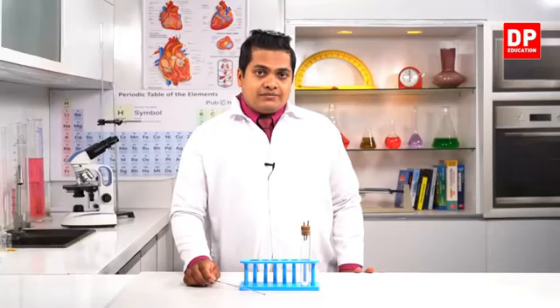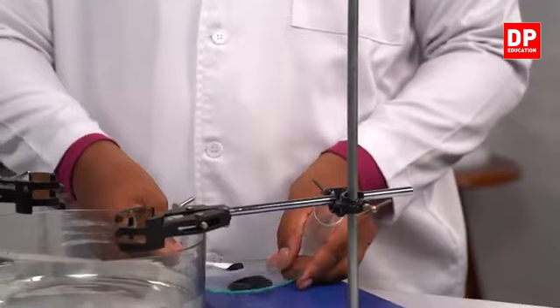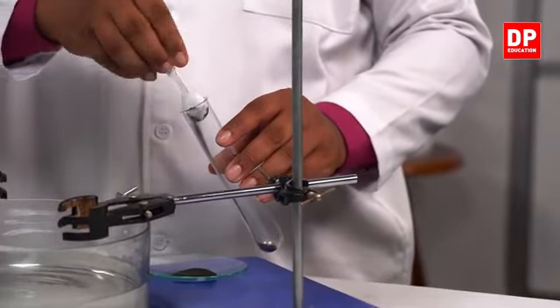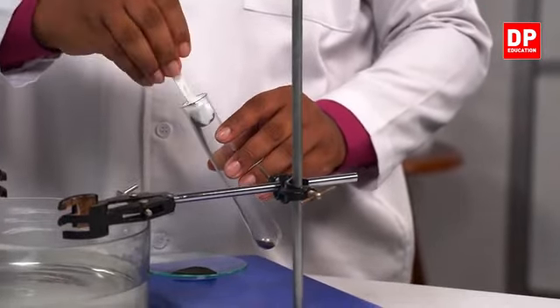I'll use a small spoon. Then I'm going to insert this iron powder into our boiling tube like this. We need to insert the iron powder up to some extent.